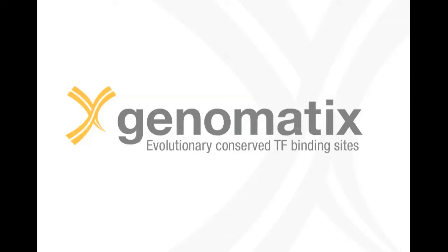Conservation of promoter function in evolution depends on the conservation of the corresponding promoter structures. Therefore, an assessment of the evolutionary conservation can help you decide which of the dozens of binding sites that you typically find in a promoter are most likely to be functional. In this tutorial, you will learn how to retrieve orthologous promoters and identify conserved binding sites in the alignment of their sequences.